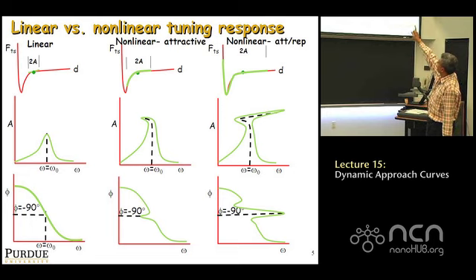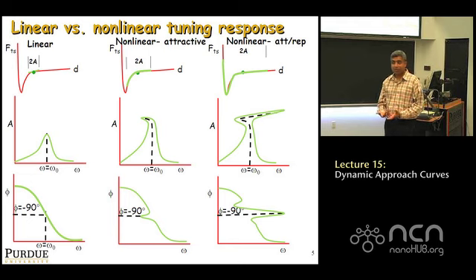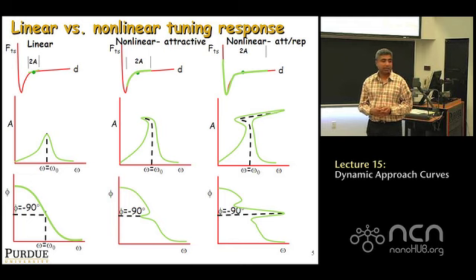So it turns out that whenever the oscillation amplitude is slightly larger, so that you're kind of going in and coming out, and now with this oscillation amplitude, if you were to sweep the drive frequency across resonance, the resonance curve becomes as shown here in the middle, okay? It's hard for me to explain fully why this happens. You will explore this in the next class using simulations.